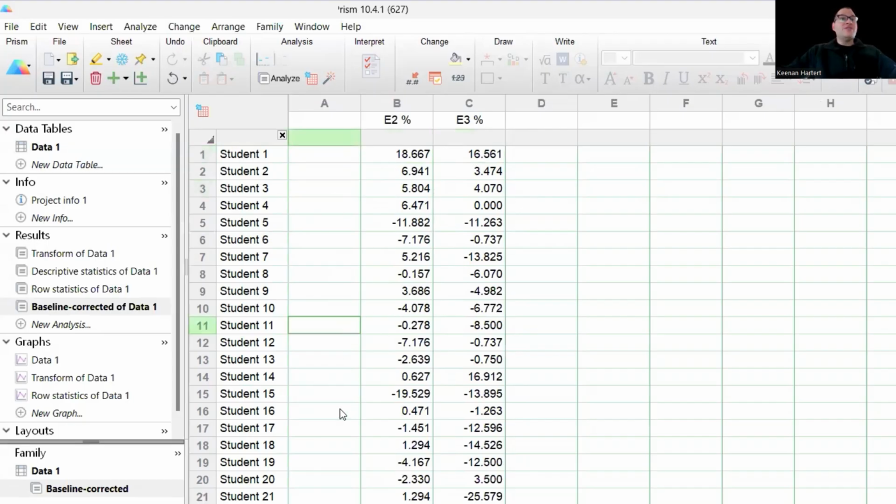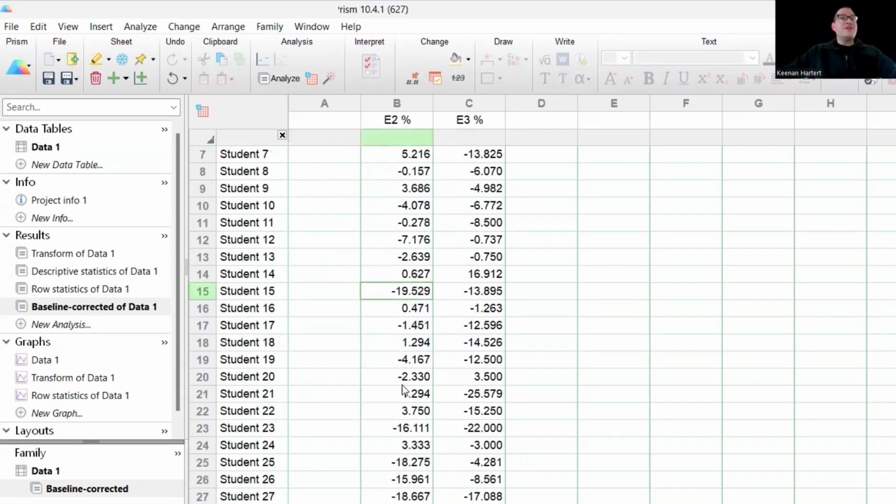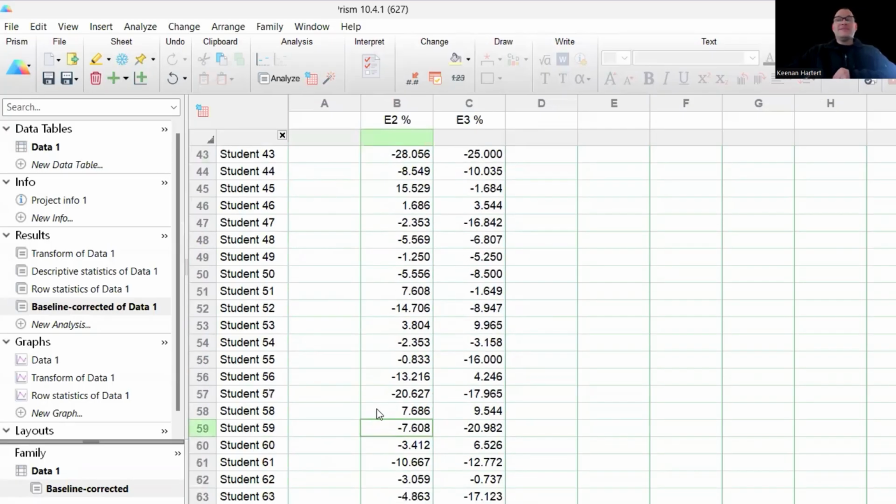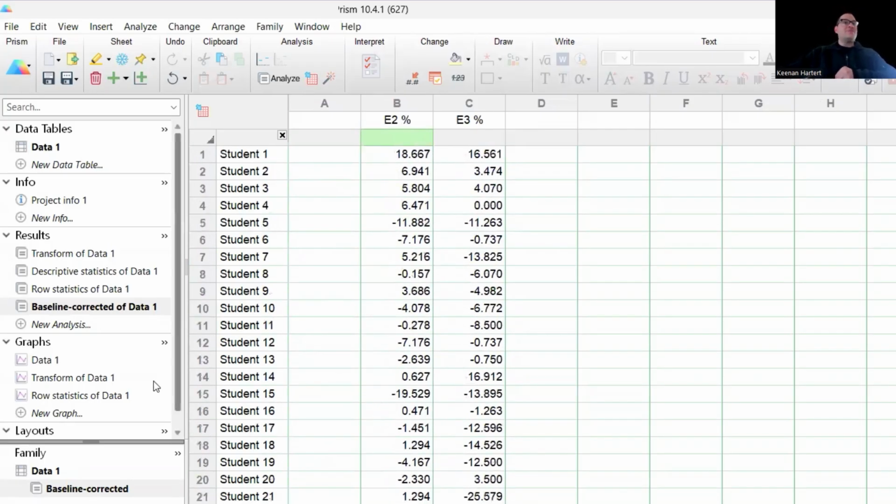So now what we can do though is you can see who fell, for example. Oh, shoot, a lot of fallers. Who gained though? Who fell really hard? Dang it. And et cetera, et cetera. So having this baseline set up here is going to be pretty nice.